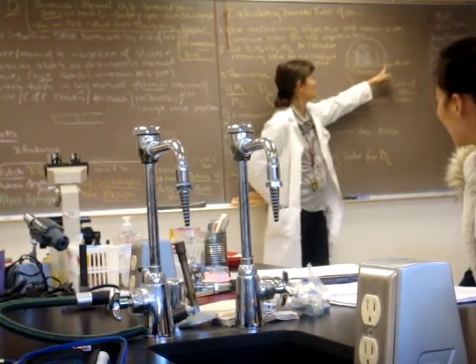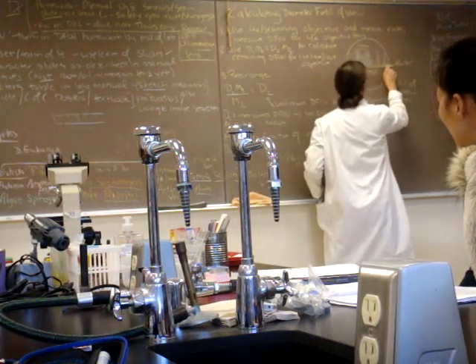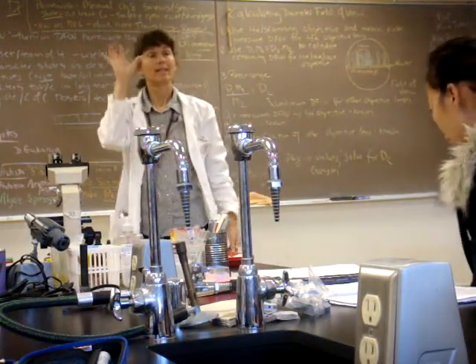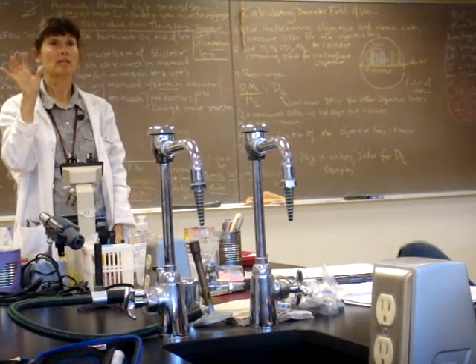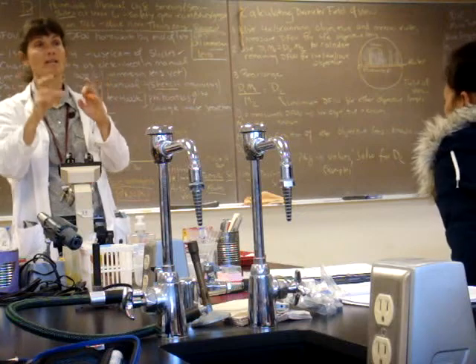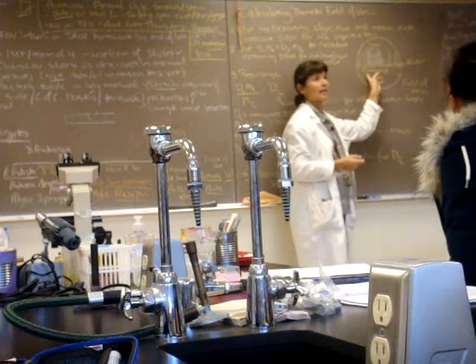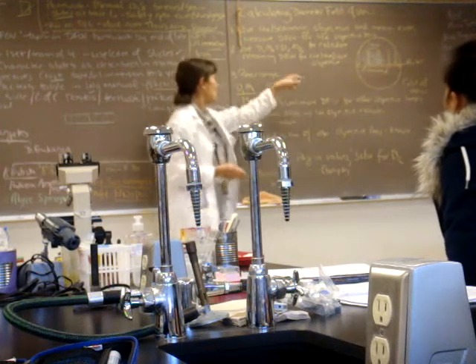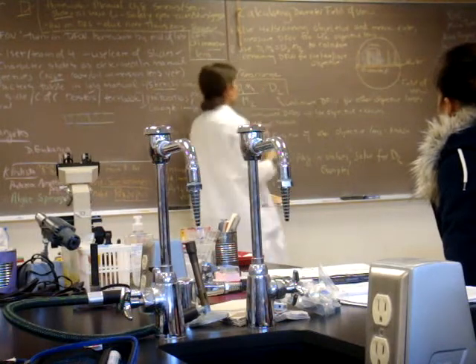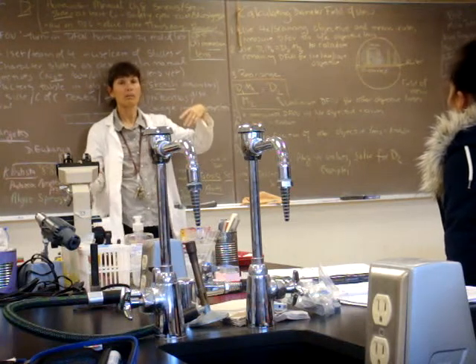So I've just drawn a line here to show the diameter. If this represents my field of view, that's the diameter. I want to know how many millimeters that is. So if I have really large cells, I could estimate the size of an individual cell. And the second reason I want the diameter for my scanning lens is I'm going to plug that value into this equation so that I can calculate the diameter of the field of view for all the higher objectives.